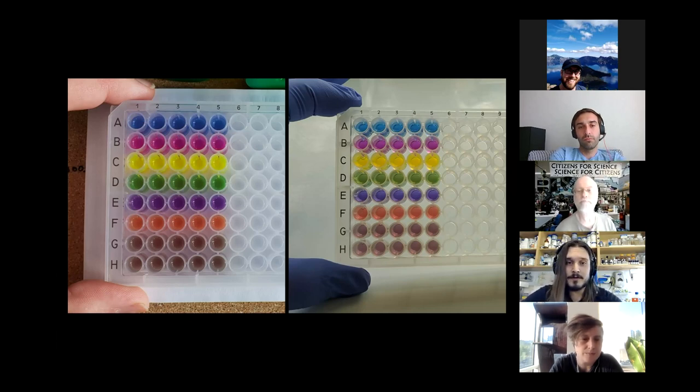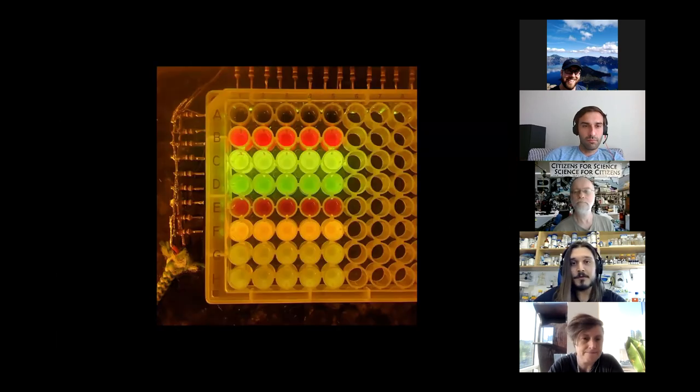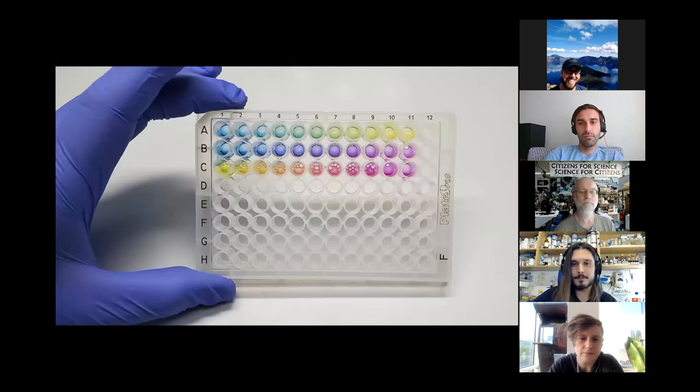So I'm working on a green right now, specifically by tying the blue and the yellow, knowing that now you can mix them around. What's also fascinating is that they glow differently too as you mix them. This is under blue light with an orange filter, 471 nanometer light, and an amber acrylic filter on top. The mixing is also gradiated, so you can get all the colors in between. Again, these are the same three proteins, not much has changed.